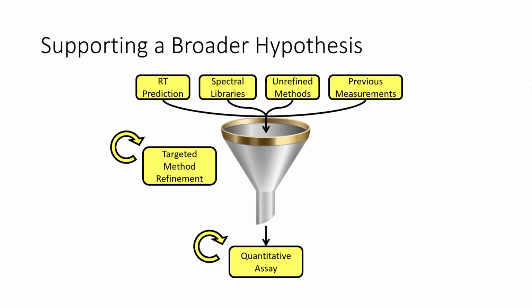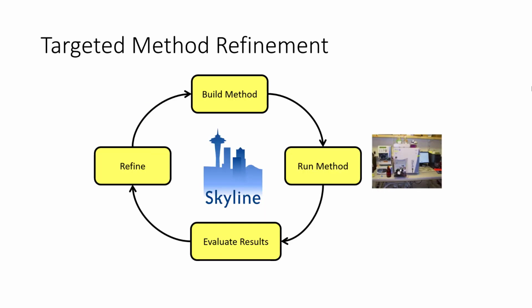if you're going to something that's clinically measurable, you're going to have to do lots of refinement from this top level of DIA that we're talking about to get down to a fully quantitative assay. We talk about using Skyline to travel around this multiple times, and I'm going to show you that even in this hugely broad DIA, I came up with a refinement that I think will give us better quantitative statistics.